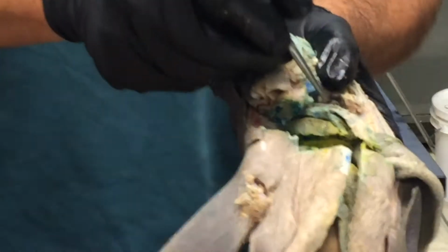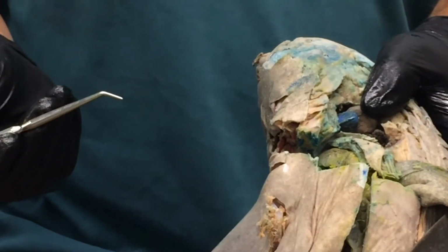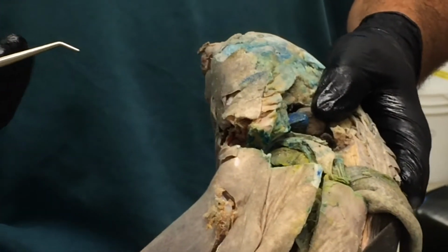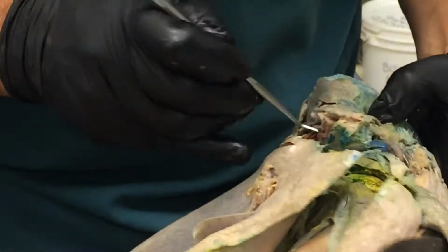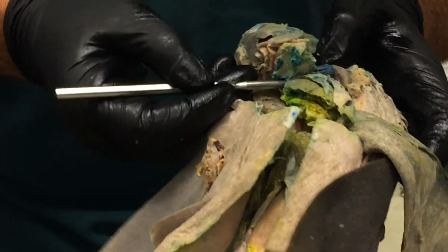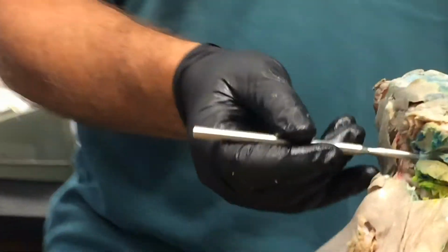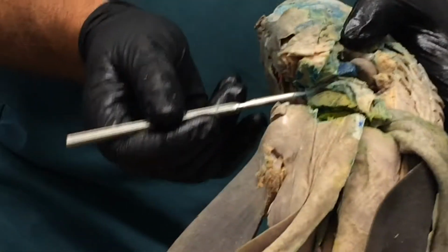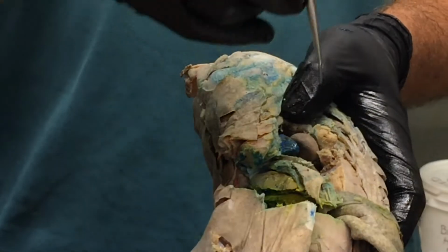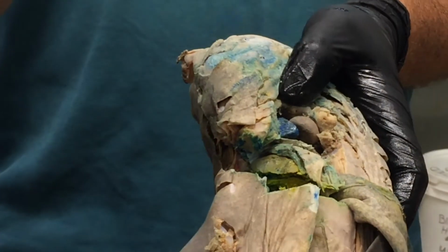Here's the sinus venosus. And the sinus venosus is receiving on either side blood coming in by way of the common cardinal veins. Exactly. And so these veins you can see here on either side entering into the sinus venosus. And they get cut when you cut the pharynx open. What's sort of hard to remember when you're looking at this is that this vessel is coming from dorsal and wrapping all the way around the gut to get ventral to get to the heart. But that's what it's doing, and it's doing so by running through the transverse septum.